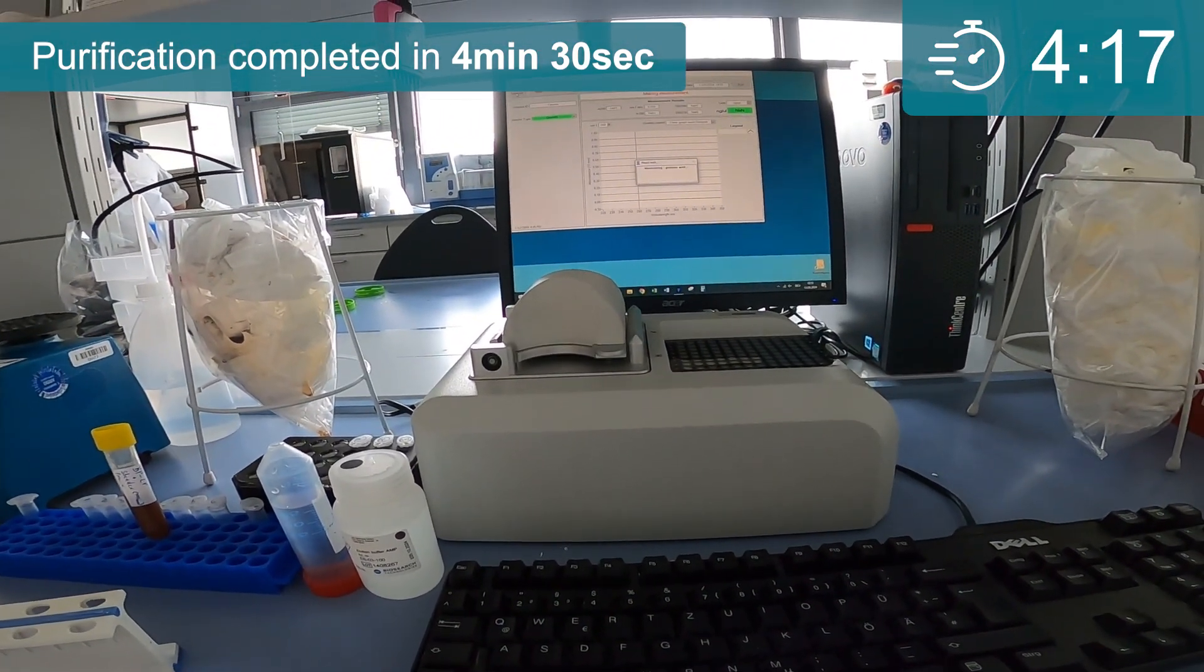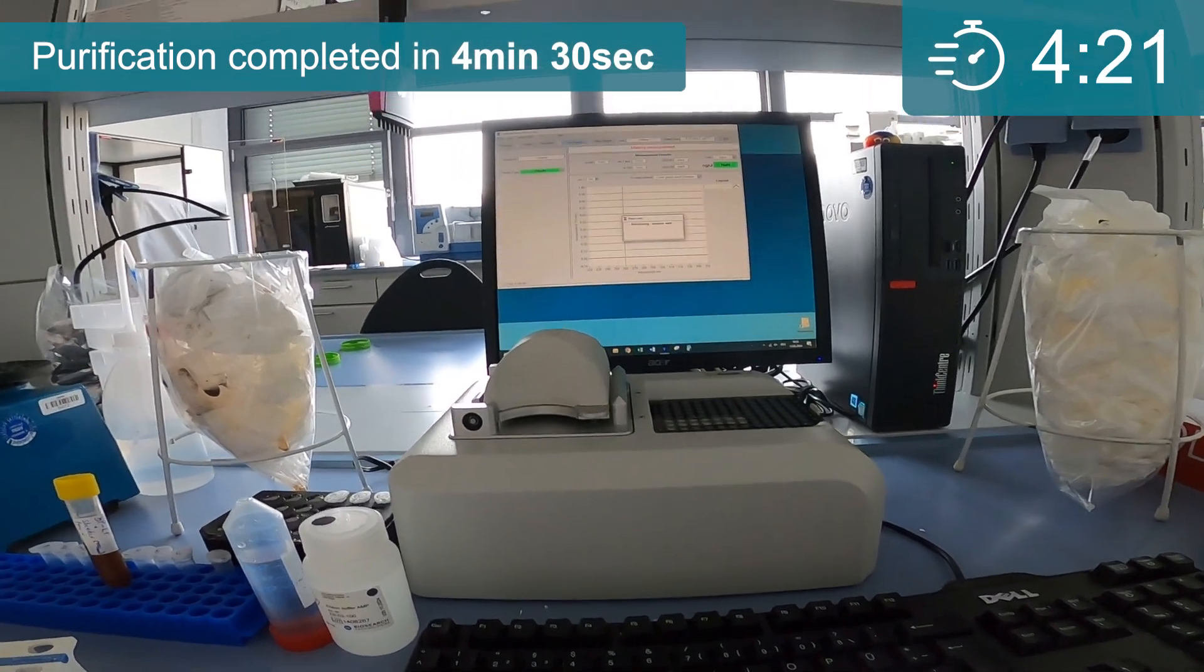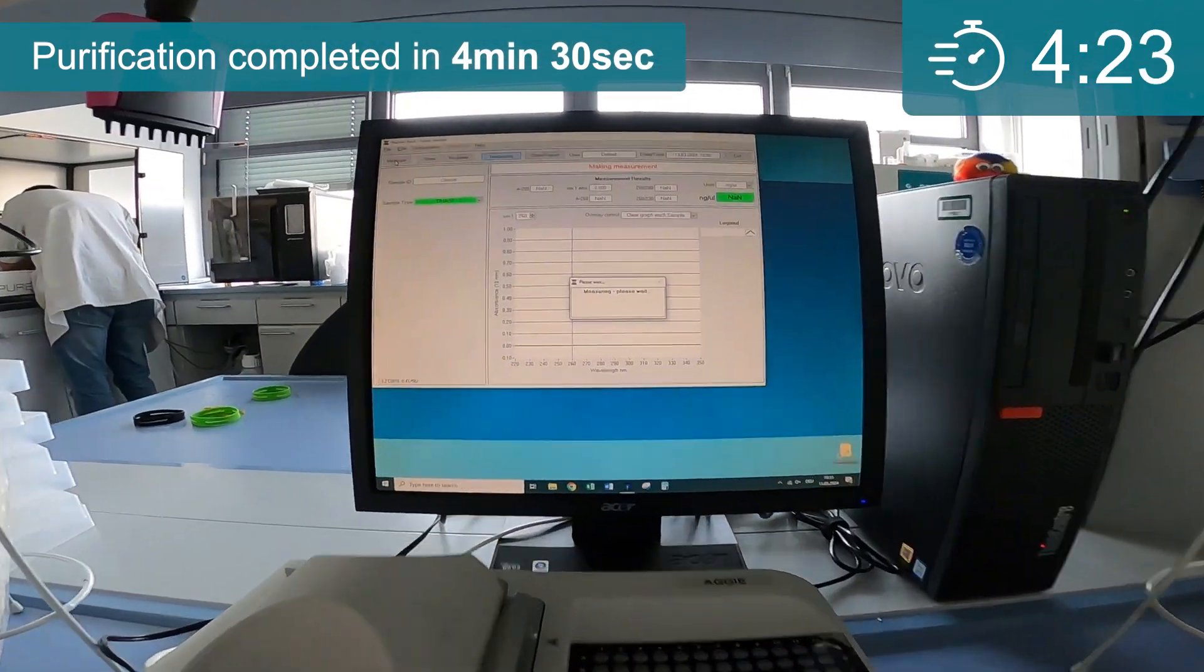When it comes to super-fast DNA purification, we have all the bases covered, so you can reduce extraction time in your lab.